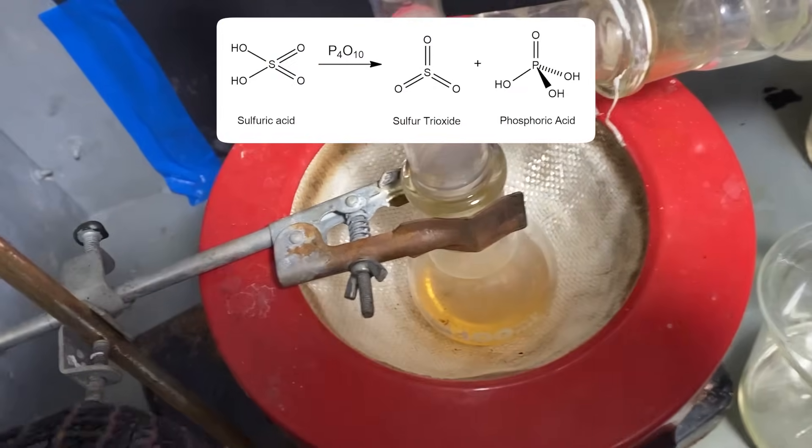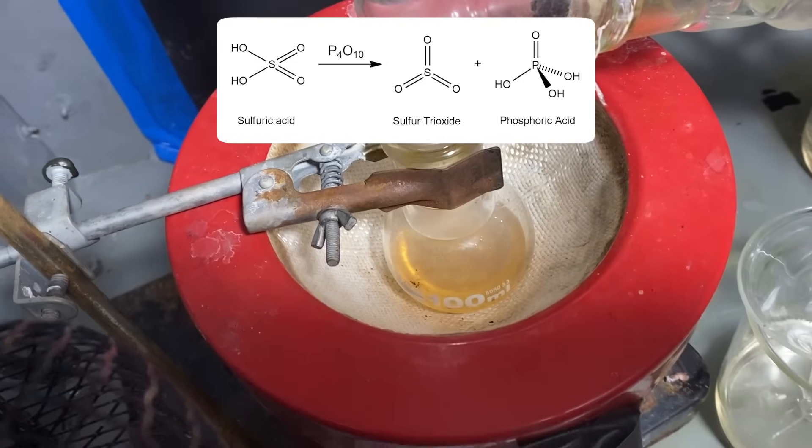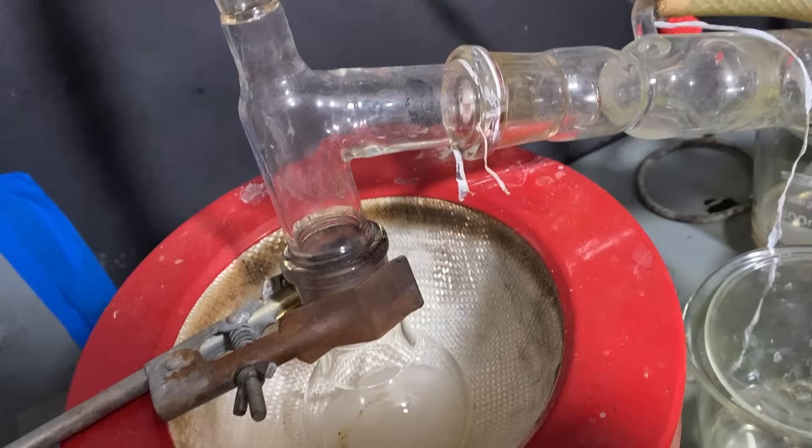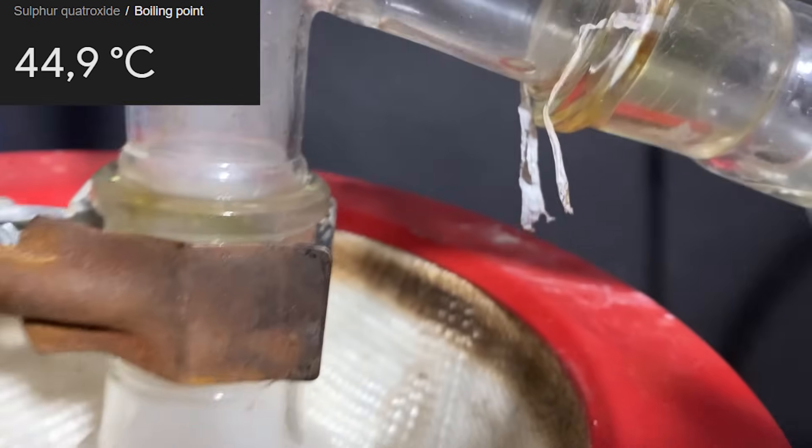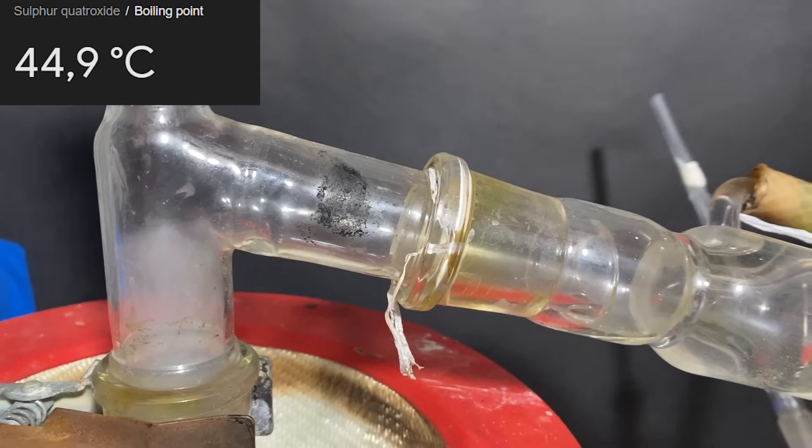Anyway, in this reaction, phosphorus pentoxide dehydrates the sulfuric acid molecule to form the sulfuric acid anhydride, also known as sulfur trioxide. For some stupid reason, you have to heat up the solution or sulfur trioxide won't form. And since sulfur trioxide boils slightly higher than room temperature, then it almost immediately vaporizes and makes its way into the condenser.